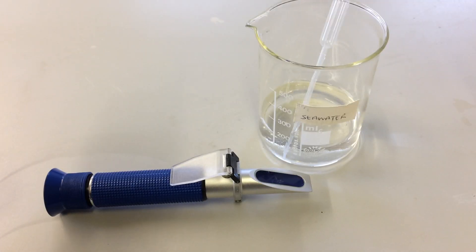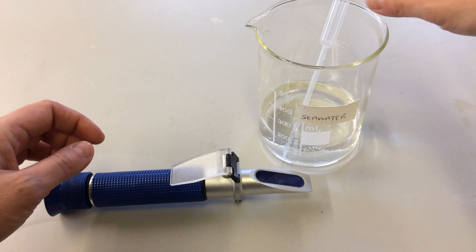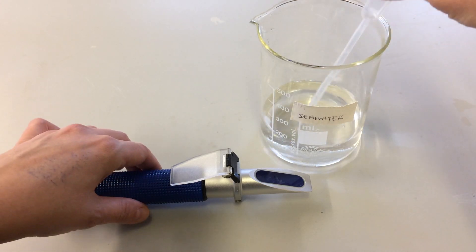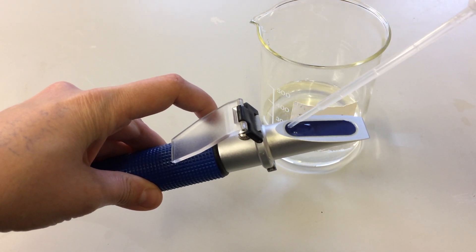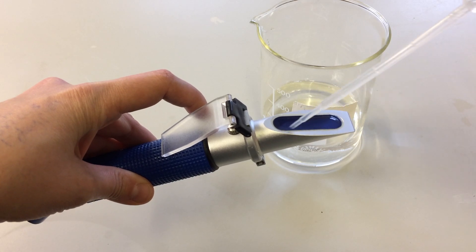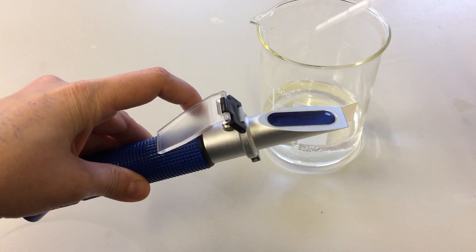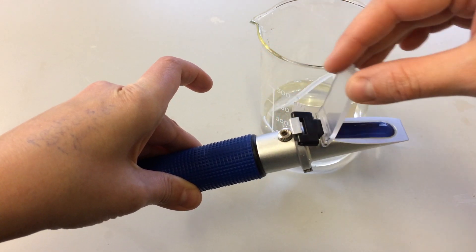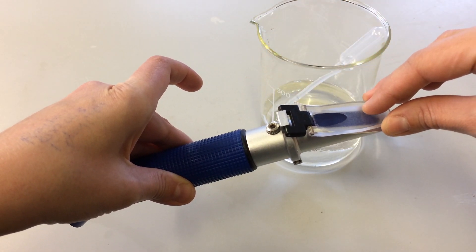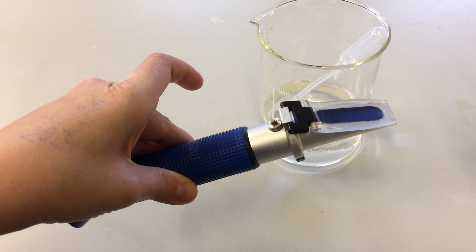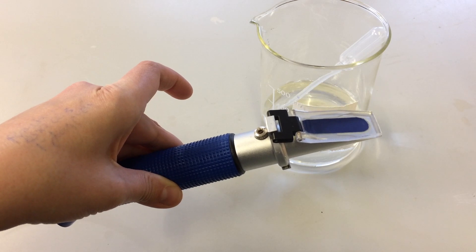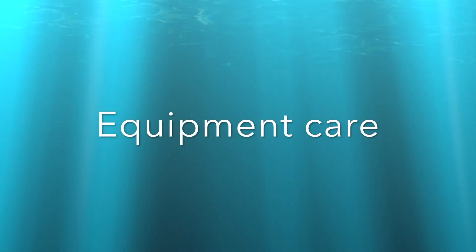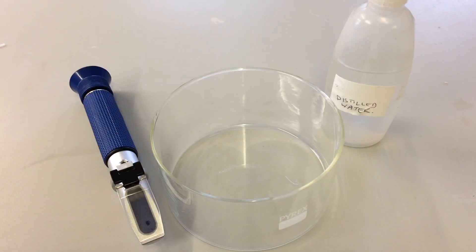You've now calibrated your refractometer and you're ready to measure the salinity levels in your seawater sample, which we have here. Simply using a clean pipette, repeat the process that you did before, ensuring that your sample is cleanly on this measurement glass section on the refractometer and ensuring that you don't have any air bubbles underneath here. Then you're ready to measure your salinity levels of your sample.